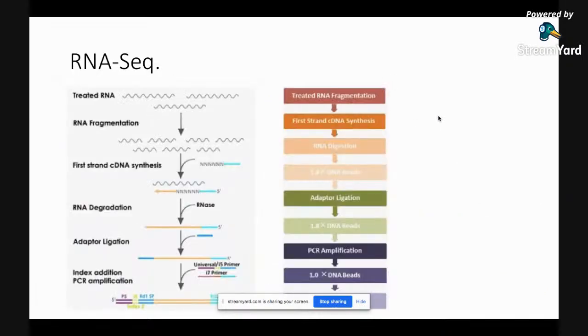So as we discussed last time, sequencing RNA is a multiple step process in which you modify the RNA to quite a large extent. So adapters are added, Illumina barcodes are added, and all of these additions have to be taken care of when we want to count the original RNA molecules, as well as then quantify them between samples, right?